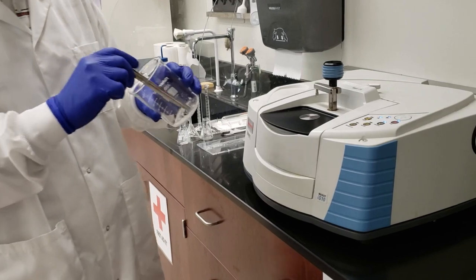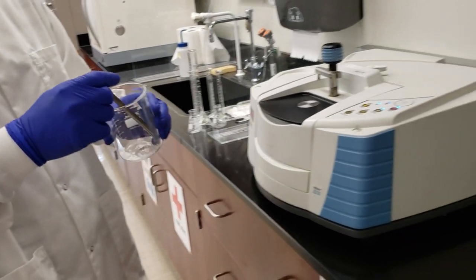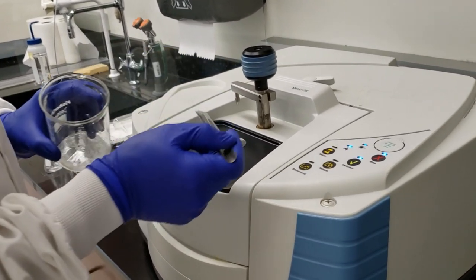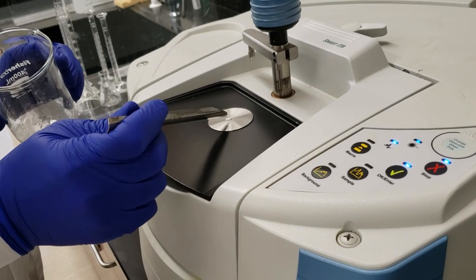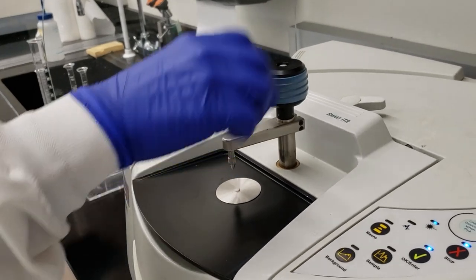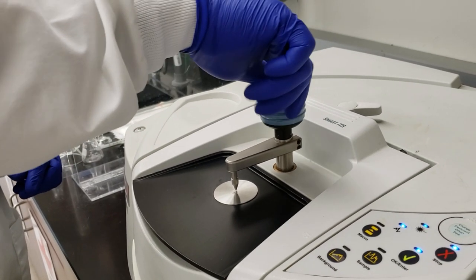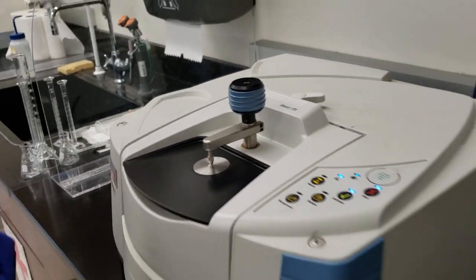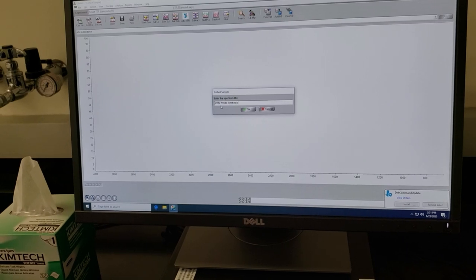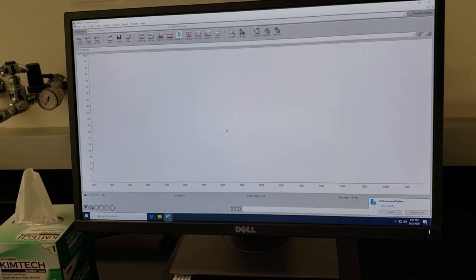So we brought our crystals over to the IR here. I've already run a background. We've already saved that to the system. So now we're going to take just a few of the crystals. Remember, all we have to do is just cover our diamond cell here. I'll go ahead and put our press down. That'll hold our crystals in place. We've already got our sample set up here. We're just calling it 2212 amide synthesis. We'll hit OK. Our sample is ready to go. Then we're collecting.